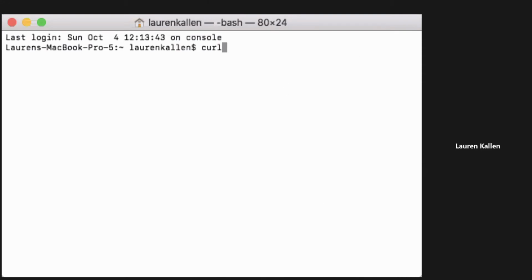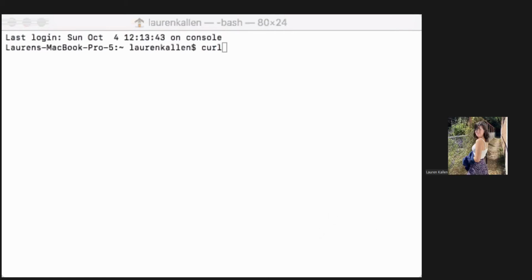So you're gonna type curl, then we've got the input, and then we're gonna put the output as Miniconda latest. Try copying that entire command there. Then to paste it into the terminal, you can delete the curl part since I included it in the thing I sent you. Okay, let's see.